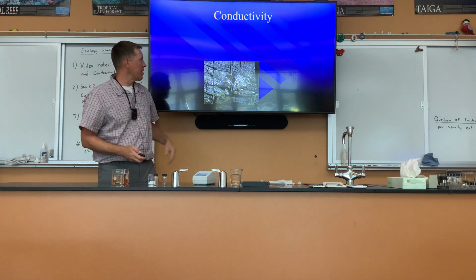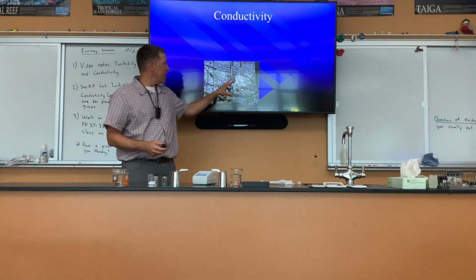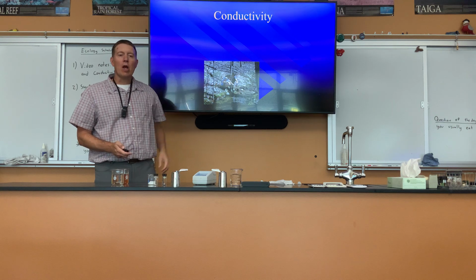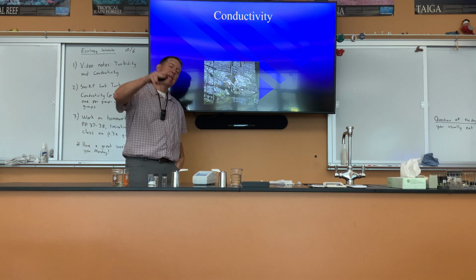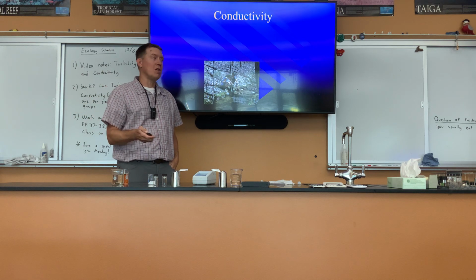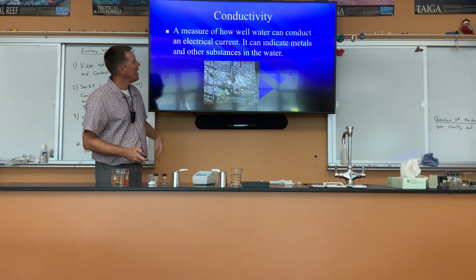But I want to move on to the next one. So here's a couple students testing conductivity. So conductivity, if turbidity is stuff that you can see in the water, conductivity is going to be measuring stuff that you can't see in the water.